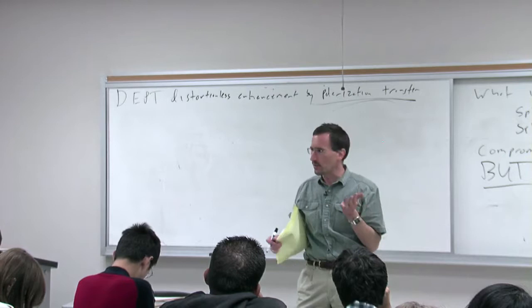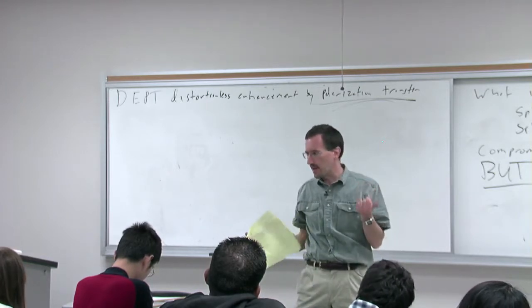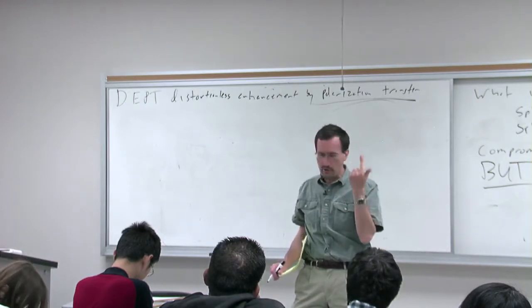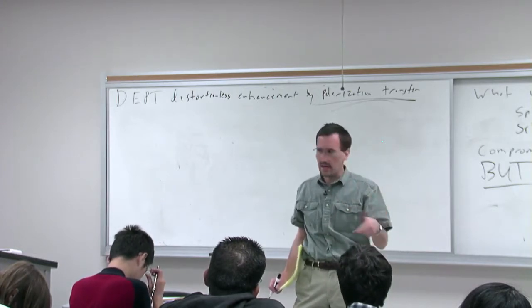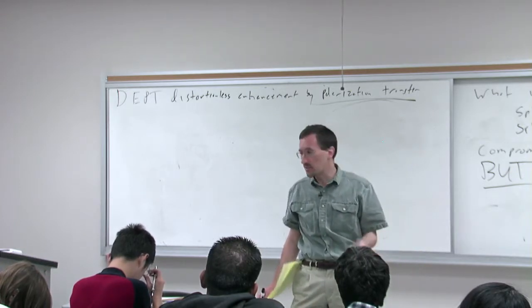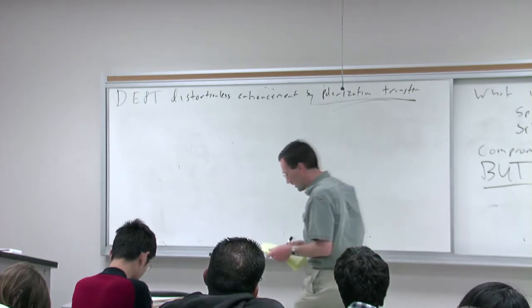You're only detecting what's associated with your C13, but then you're damned and damned and damned again by the fact that the magnetogyric ratio of carbon is 1/4 that of proton, because your Boltzmann distribution is 1/4 as big, your vector is 1/4 as big, it's processing 1/4 as fast, and each of those goes to 1/4 of 1/4 of 1/4 of the signal that you get for proton. And then you throw that on top of the 1%, and you're down at like 1/5700th the signal.